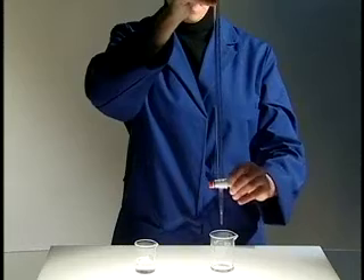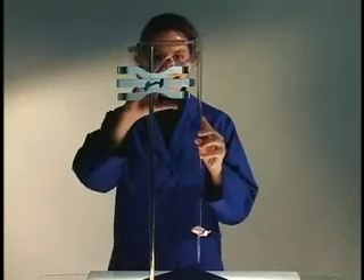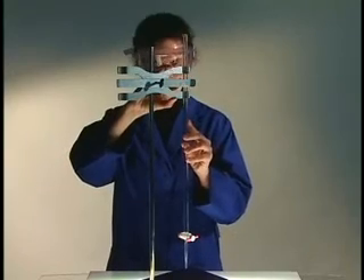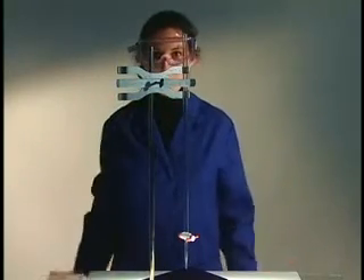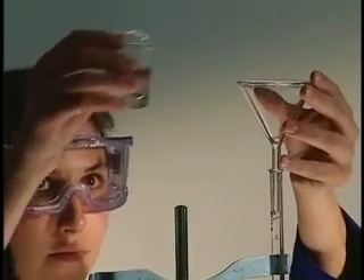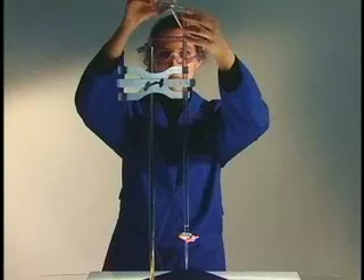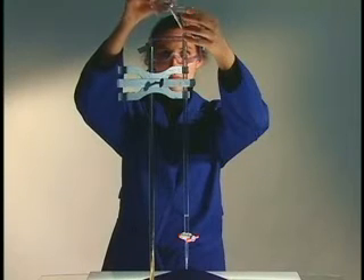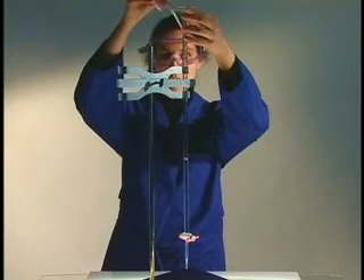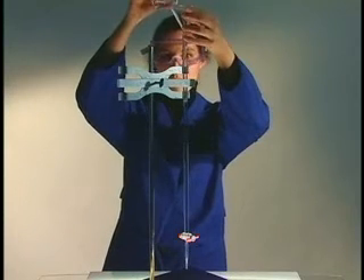Repeat the rinsing procedure once more. Clamp the burette to a ring stand or other secure mount. Hold a funnel slightly above the mouth of the burette and carefully pour in the solution. Fill the burette to approximately one milliliter above the zero line.